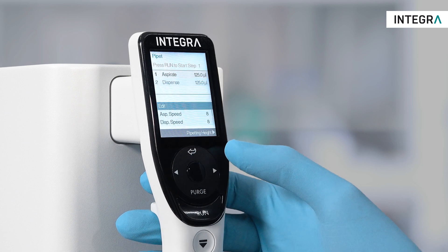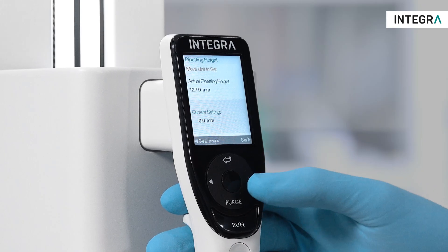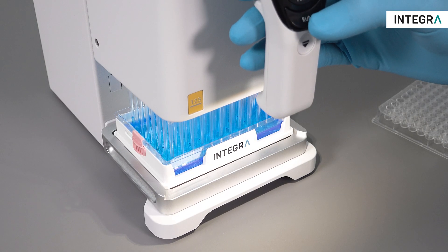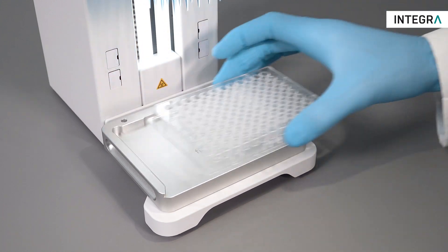A pipetting height can be defined as well. This defines the lowest possible pipetting height, for example, the bottom of a well plate or reservoir. To pipet, simply enter your liquid and press run to start, then add your target well plate.